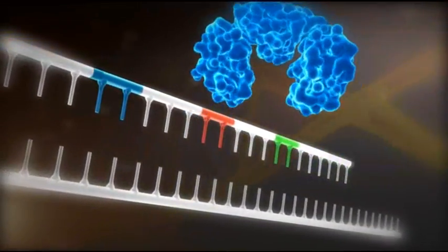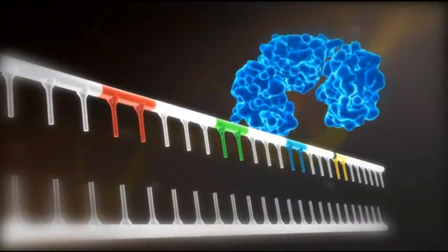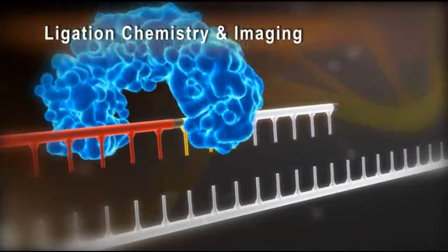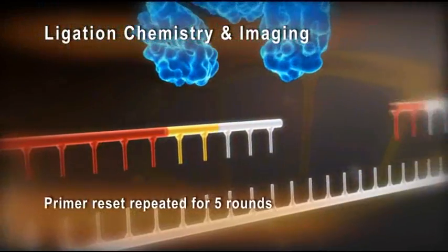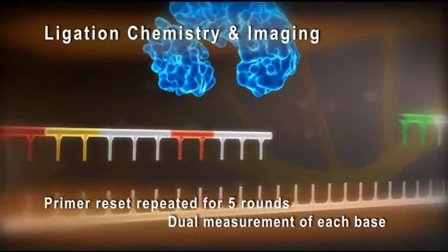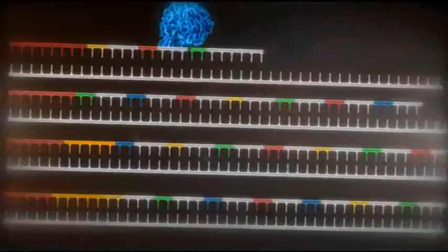This process is repeated for seven cycles and yields a 35 base pair read. Additional cycles can be added to extend the read length. The synthesized strand is removed, a new primer is hybridized offset by one base, and the ligation cycles are repeated. This primer reset process is repeated for five rounds, providing a dual measurement of each base separated by several cycles, which increases the sequencing accuracy.